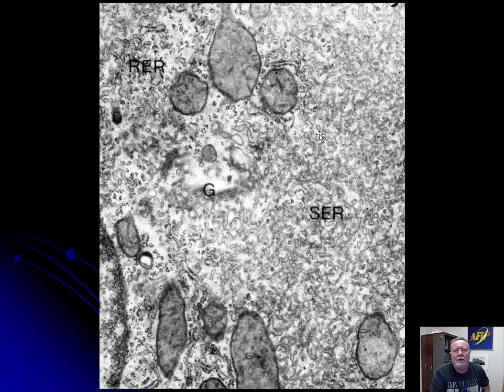I skipped one. Okay, now let's start to put a couple of these things together. Here is a section from one cell. We have a very tangential piece of a nucleus. I can't tell how big this nucleus is from that. I'm not even going to try. As I describe this, I'll describe all the things that I can identify. I can identify a part of the nucleus.